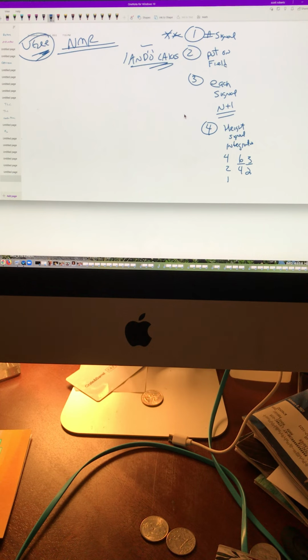All right. So, my little Oogie fans, these are our rules. Number the signals, put them on the field, determine each signal, and let's look at the height. Got to memorize. 0 to 2 is where methyls appear. Any kind of CH2, CH3s, methyls. They can be shifted by halogens and stuff, but right around 0 to 2 is a good number to know. 4 to 6 are for what do you call alkene hydrogens?